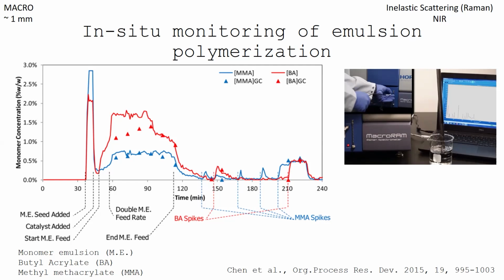And what's important about this for this particular process was that in this polymerization, the goal was to have a particular shape, and they had to have tight conditions on their growth process to achieve that particular polymer shape. And so this way they have a real-time feedback of the rate of consumption and reaction.